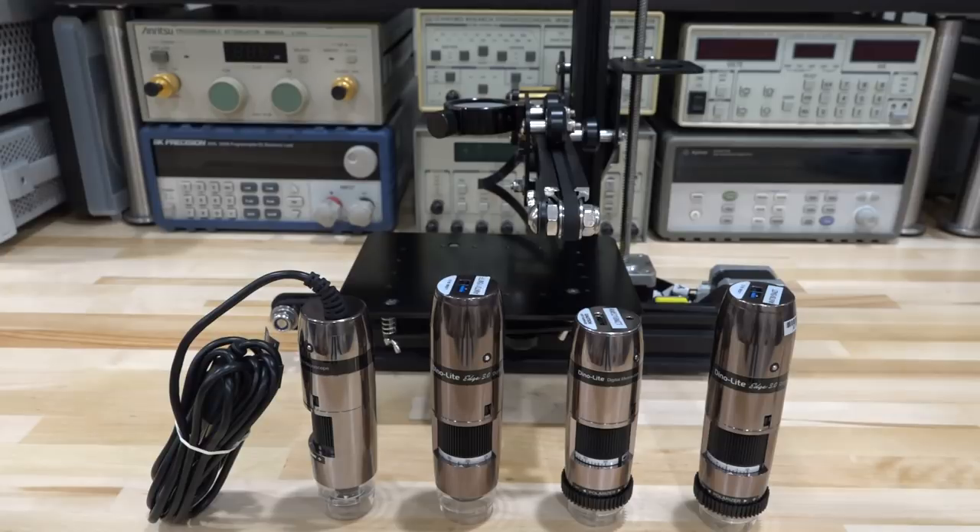Hi, welcome to the SignalPath. If you recall a while ago, I did a full review of the DynoLite USB-based microscopes, and I showed that these units have fairly good optical performance. They have other interesting features like polarization control, photograph stacking, depth of field control, as well as doing various measurements of distance and dimensions. These have been very handy because I've been using them for a lot of my videos, and every time I show you a close-up of a die or a modular component, that's the microscope I've been using.